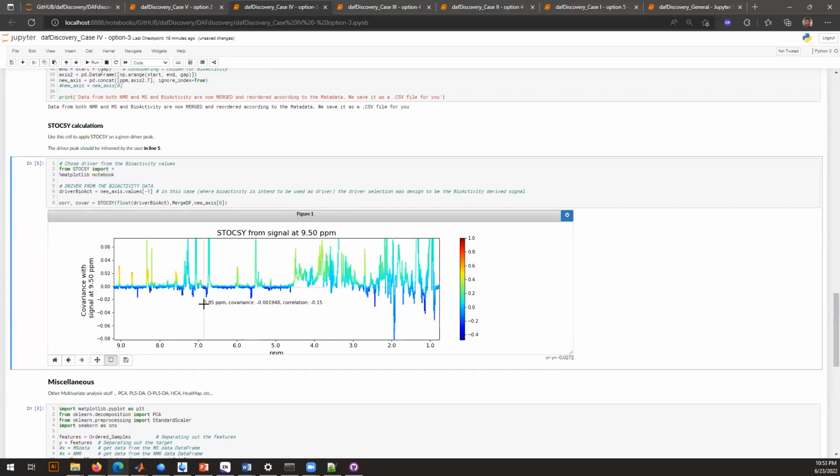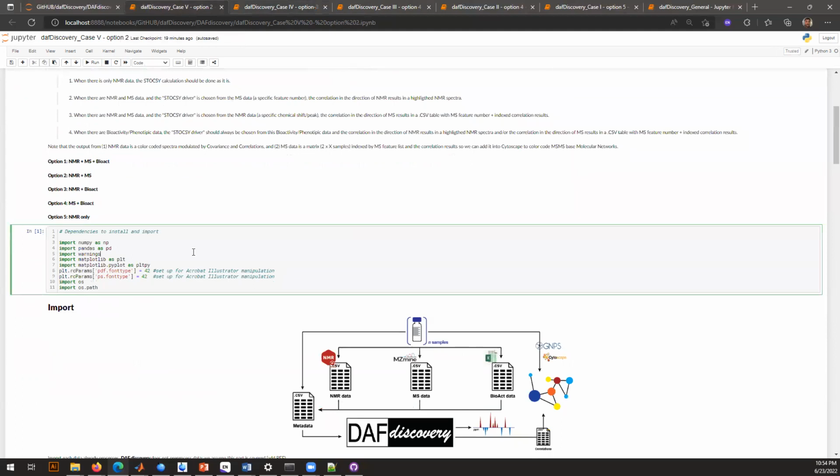This is just indicating that the higher the concentration of the peak, the bioactive compound, the lower the MIC will be. So we want to see an indirect correlation. So we can select these peaks here. Those are peaks that are correlated to the bioactivity. In this case, correlated to lower values of MIC. For this study, this was the case. And one last example.